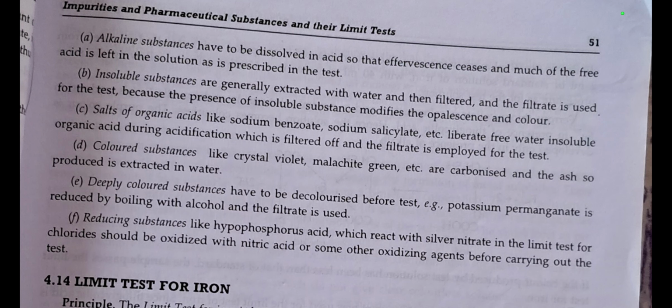For a reducing substance like hypophosphorous acid, we add nitric acid in order to prevent precipitation of other acid radicals. Later we can perform the limit test for chloride and sulphate. Thank you.